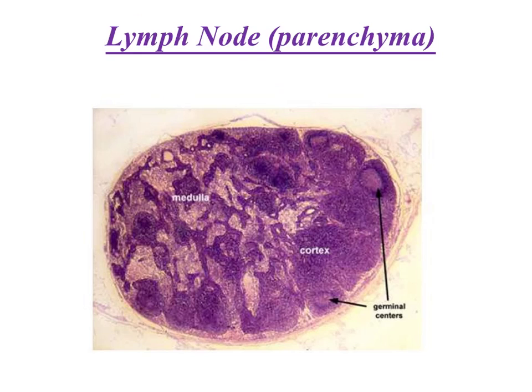This is the picture for the lymph node demonstrating its parenchyma, which is described as outer cortex and inner medulla. Here in the cortex you can see the lymphatic follicles or nodules present in the cortex, and in the medulla you see these irregular cords. That's to say, we have rounded or oval structures at the cortex, and in the medulla we have irregular cords or irregular spikes like this.